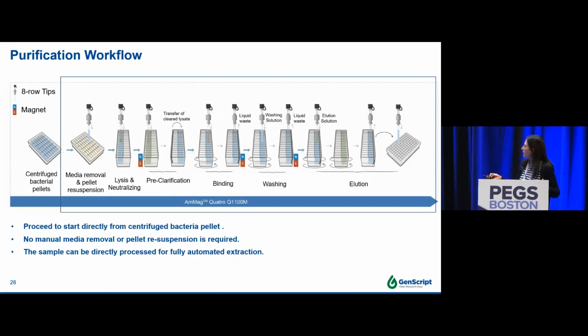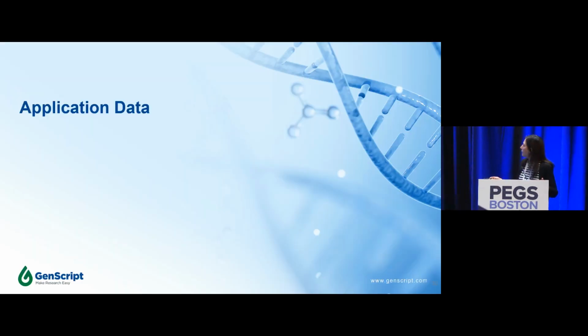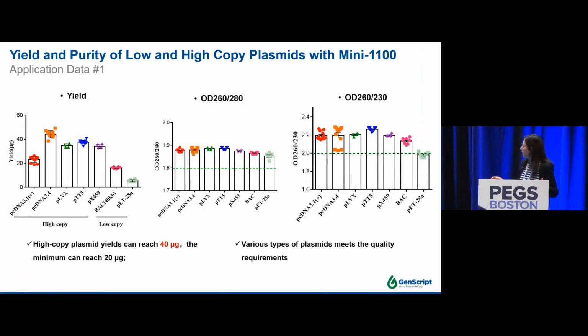So here is the workflow. I'm not going to go through this because it's essentially the same as the maxi prep instrument that I already talked about. This is an example of the protocols, with all the parameters that you can change during the run. And then I'm going to go through some application data really quick.